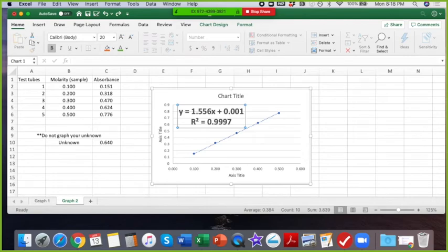How will we turn in the charts? So here you can save it and then you can upload it as part of your lab. Yeah, I think it'd be too much of a hassle to print it out. So I would just say save it and then upload it as part of your lab. With any of the submissions, you can upload as many files as you want.